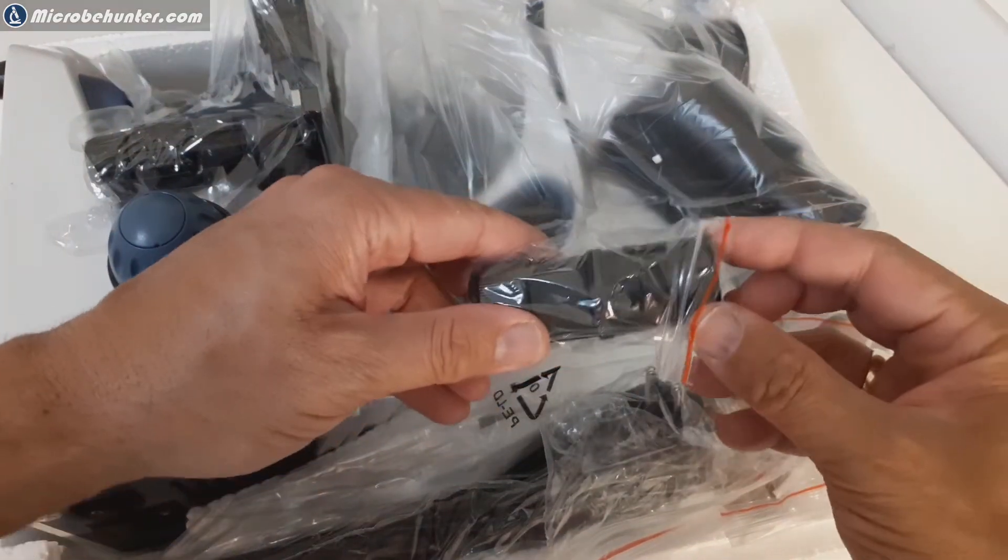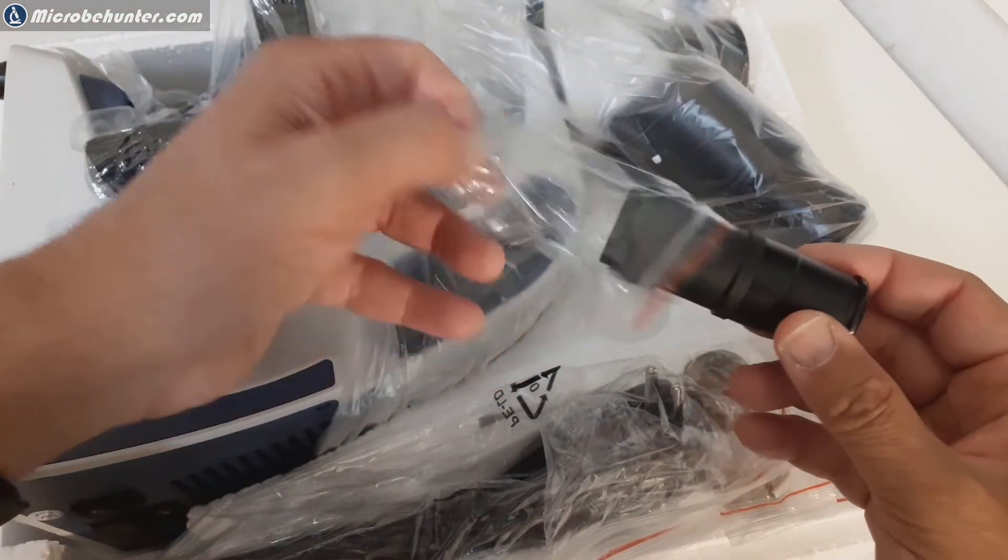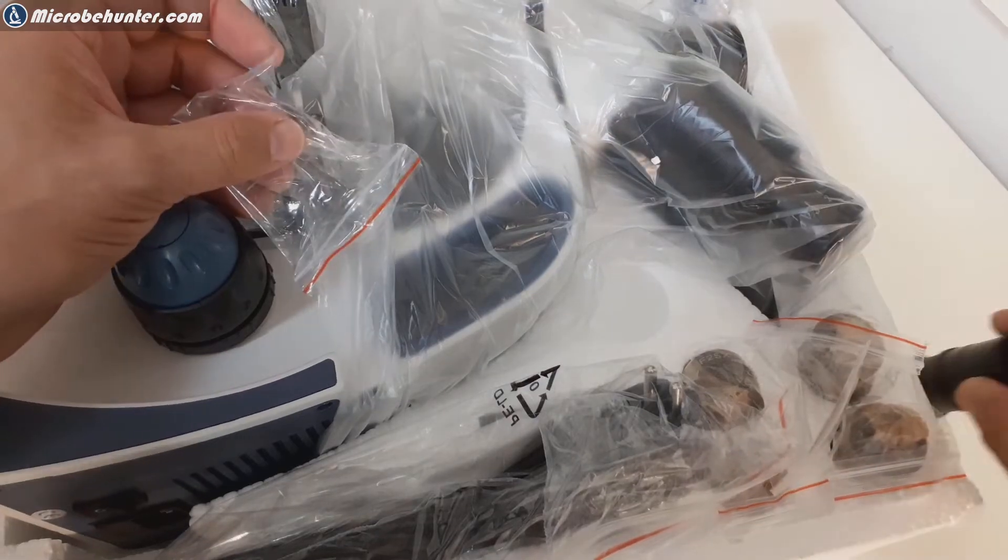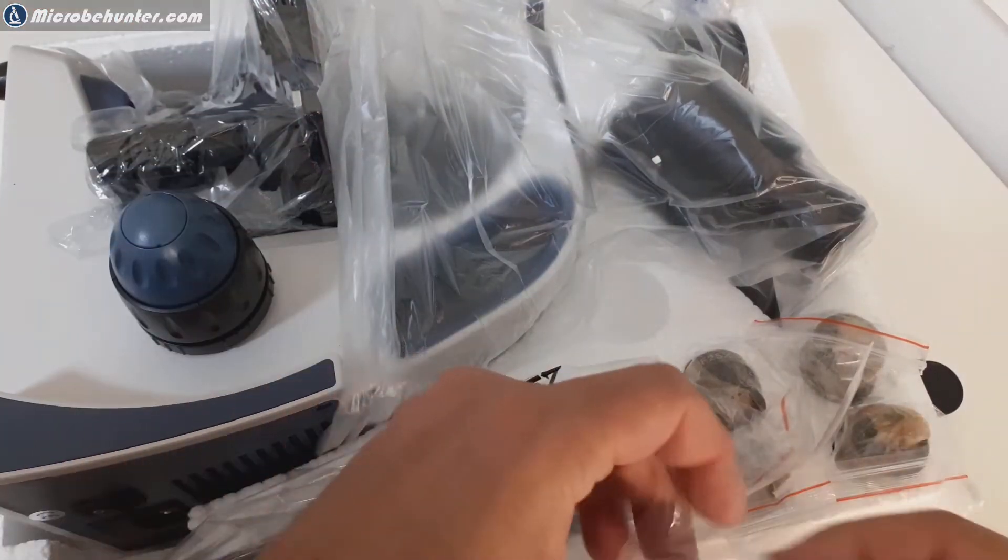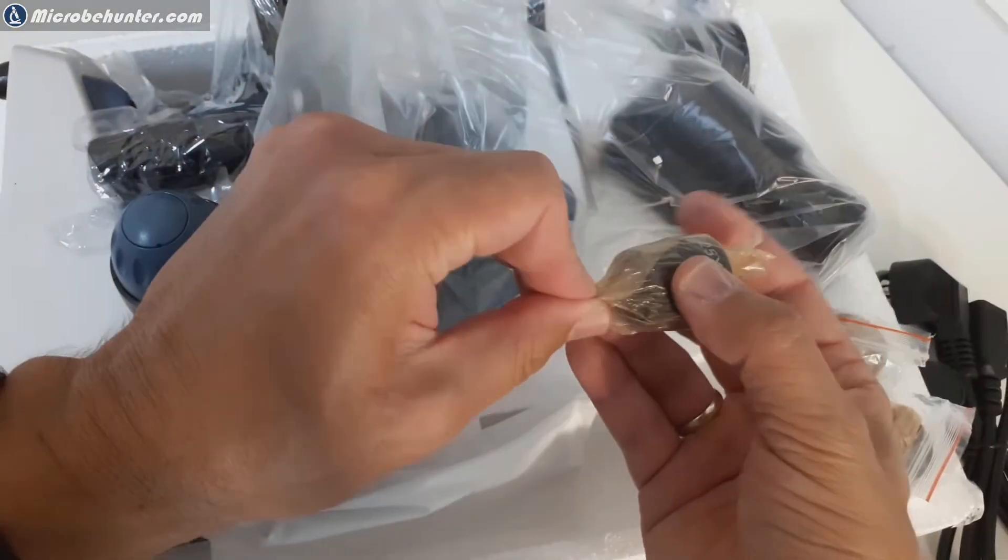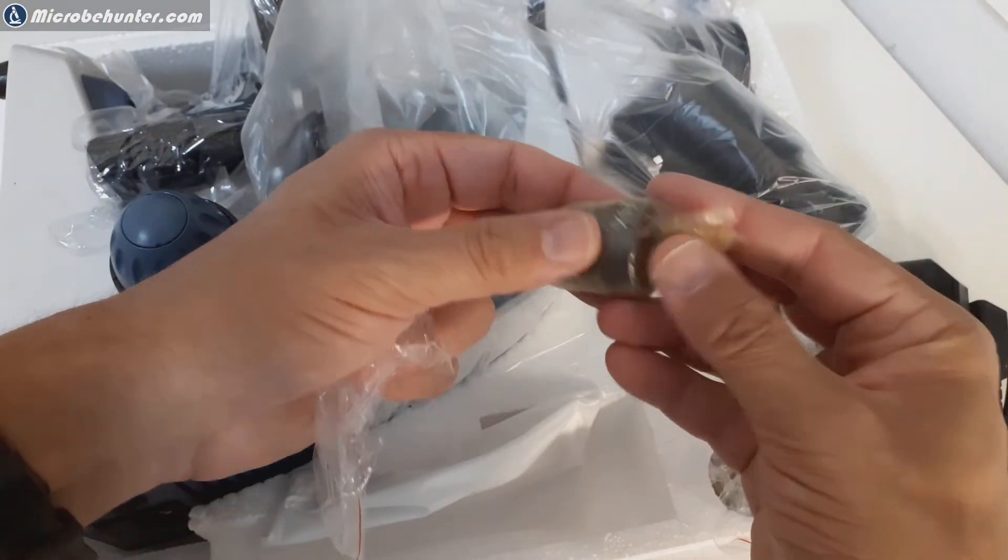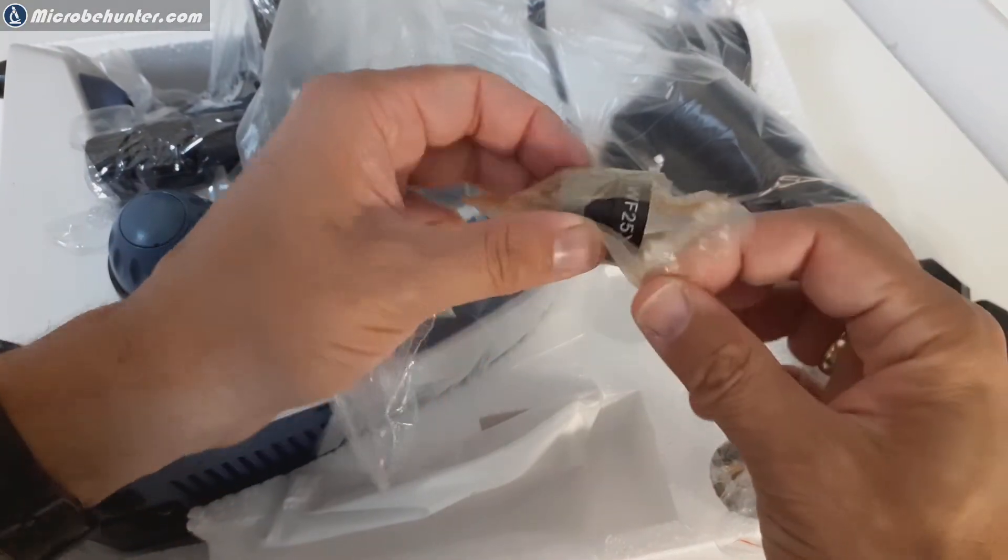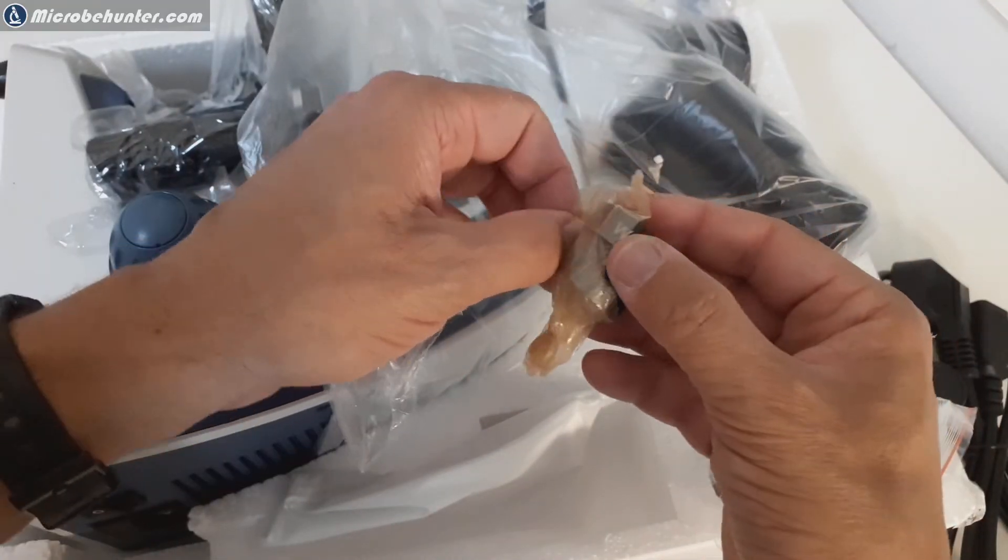Let's start taking out the things here. This is the trinocular tube for the photo camera which has to be still connected. Some other parts here - of course a power supply cable. It has an internal power supply and not an external one.